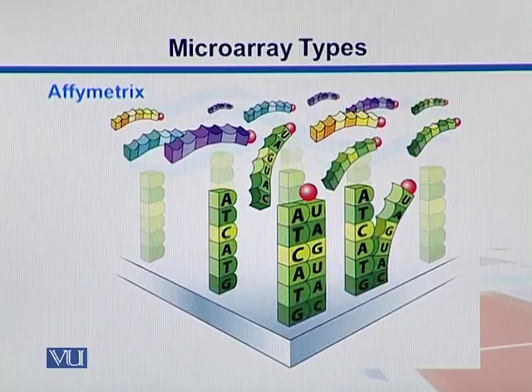Here comes our RNA, which is the target RNA. It comes and attaches to the probes present on the chips. When it attaches, it has some tags attached. These target RNA molecules are attached with biotin, and biotin is then attached with streptavidin, and streptavidin has phycoerythrin attached, which gives the color when a laser is passed through it. After the hybridization, we get spots highlighted by these colors, and then we can get the relative intensity of those spots. That is the measure of the expression.